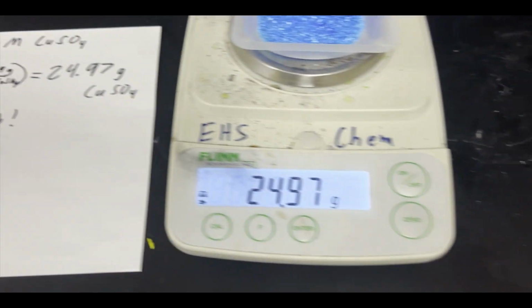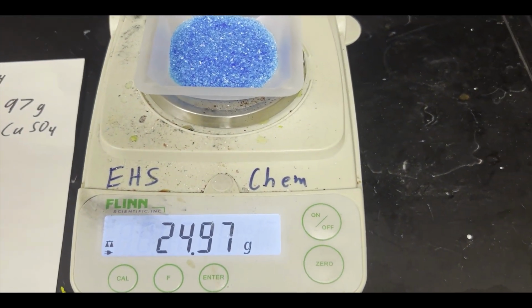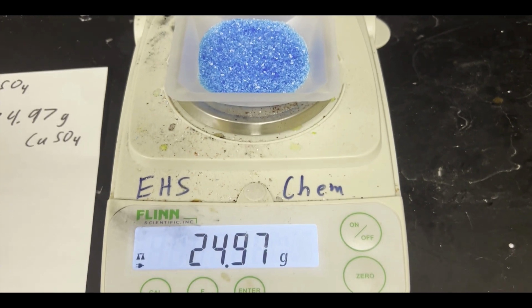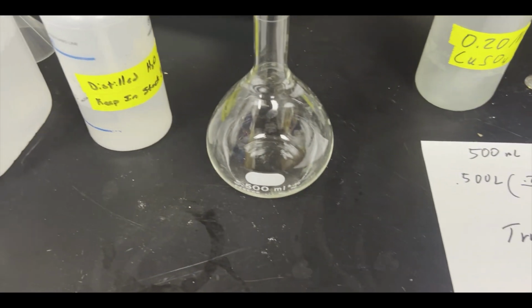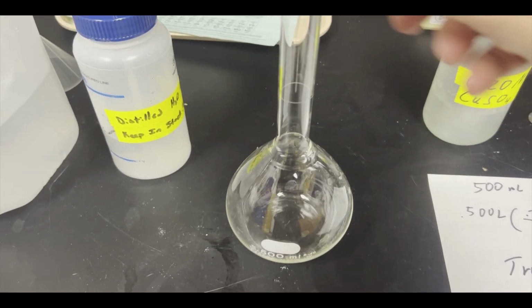Okay, so step 1 is to go to our balance and get the 24.97 grams of copper sulfate, which I have already done. That's sitting there ready to go. Step 2 is to start mixing it into our volumetric flask to get this proper.